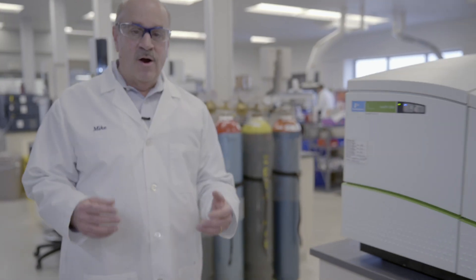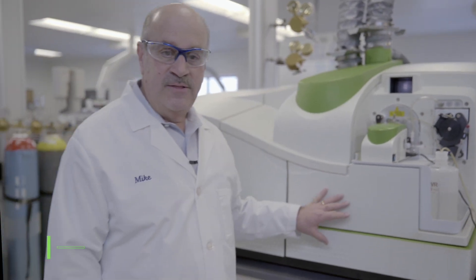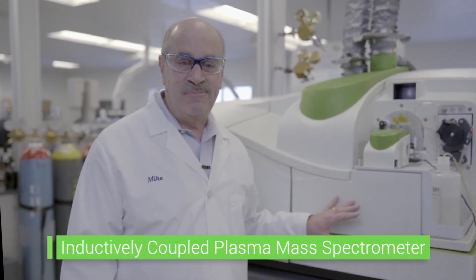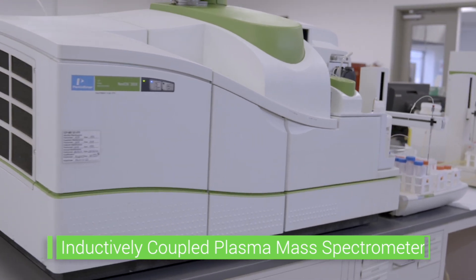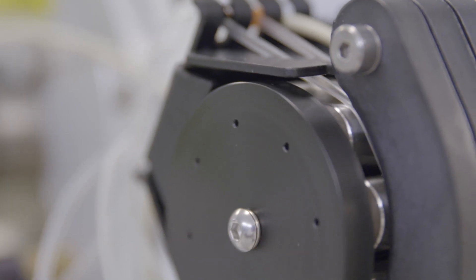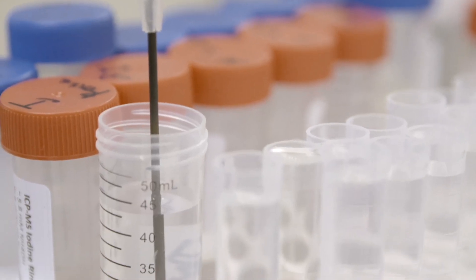Another thing that we always want to check for are heavy metals, which come from the soil and go into the plants — bad heavy metals, things like lead and mercury. This is an instrument called an inductively coupled plasma mass spectrometer and it can find heavy metals down to the part per billion level. It's extremely sensitive, and this is a way that we can make sure that your products are as clean as they could possibly be.